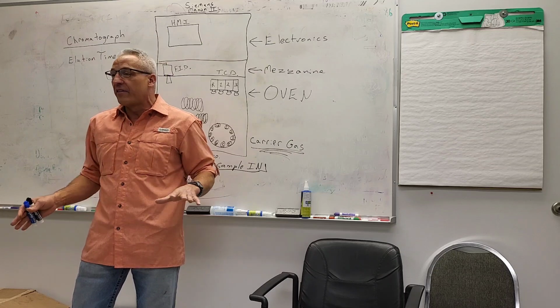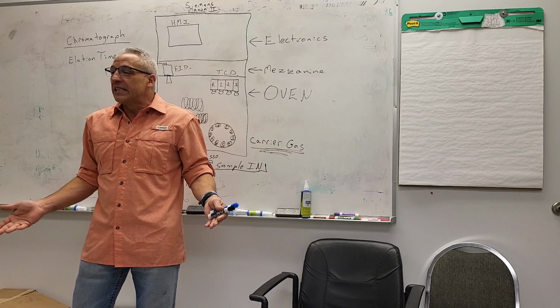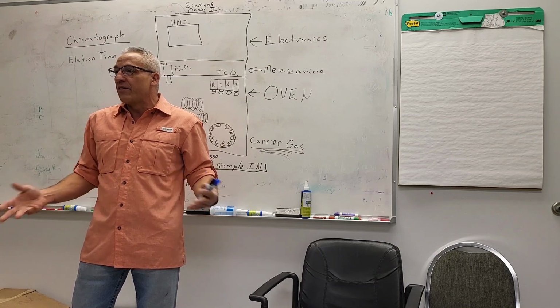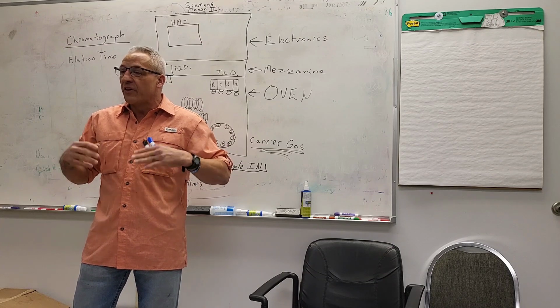Here are the basic concepts of chromatography, and once you understand the basic concepts, then it doesn't matter what GC you're working on. They're all basically the same, and then you just have to learn the button pushing, because they're all going to be doing the same thing.